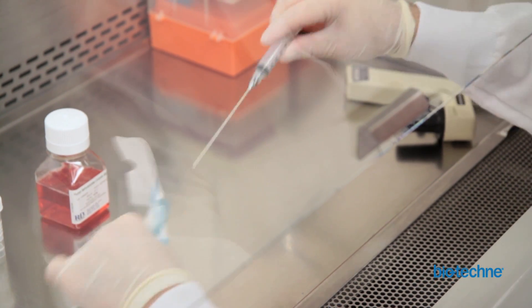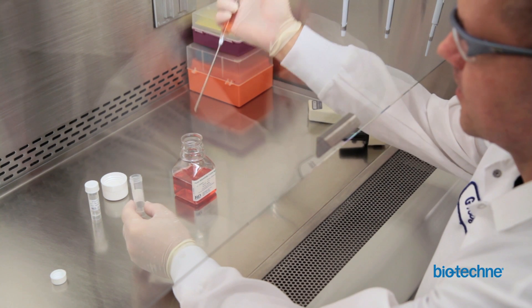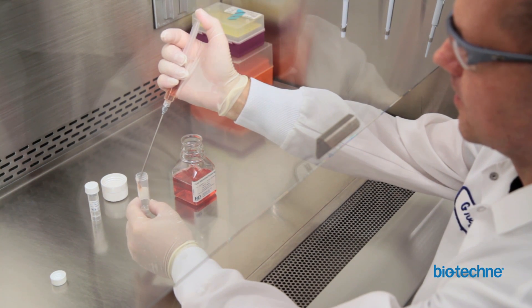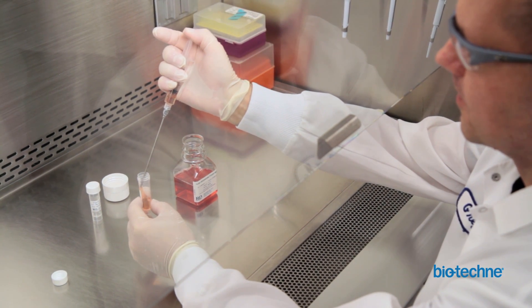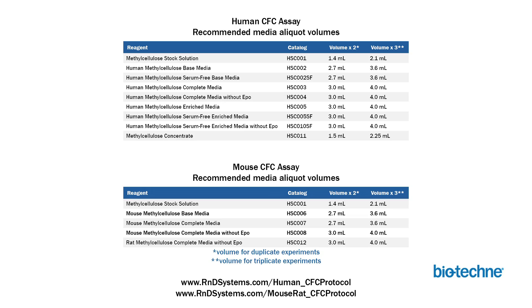Aliquot the media into a sterile 5-milliliter tube. Due to the high viscosity of methylcellulose-based media, the use of a sterile 14-gauge laboratory pipetting needle and a 5-milliliter syringe is required for accurate measurement. The exact amount of media to be aliquoted will vary depending on the type of media and number of replicates for each experiment. Recommended aliquot volumes for human and mouse CFC assays can also be found in the detailed written and online protocols. Aliquots should be stored at minus 20 degrees Celsius in a manual defrost freezer.